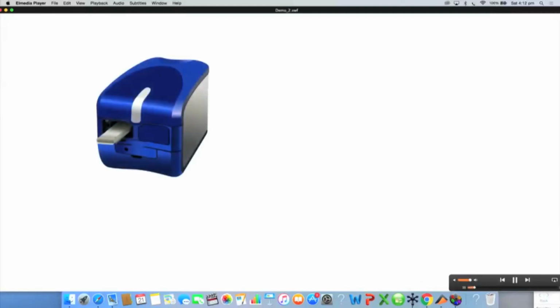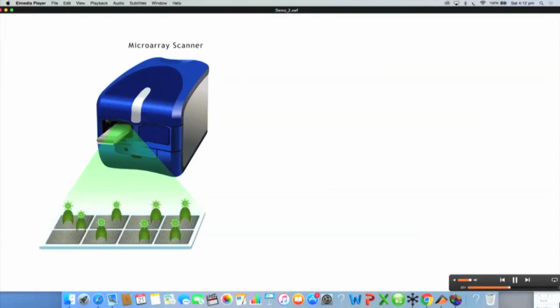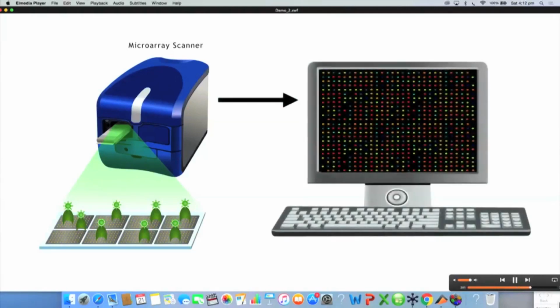Once the unbound proteins are washed off the array surface, the protein interactions are detected by means of an array scanner. These protein microarrays are extremely useful in studying interactions with other proteins, as well as small molecules, DNA or RNA. Let us now talk about a different type of protein microarray platform, for example, the direct labeling based method.